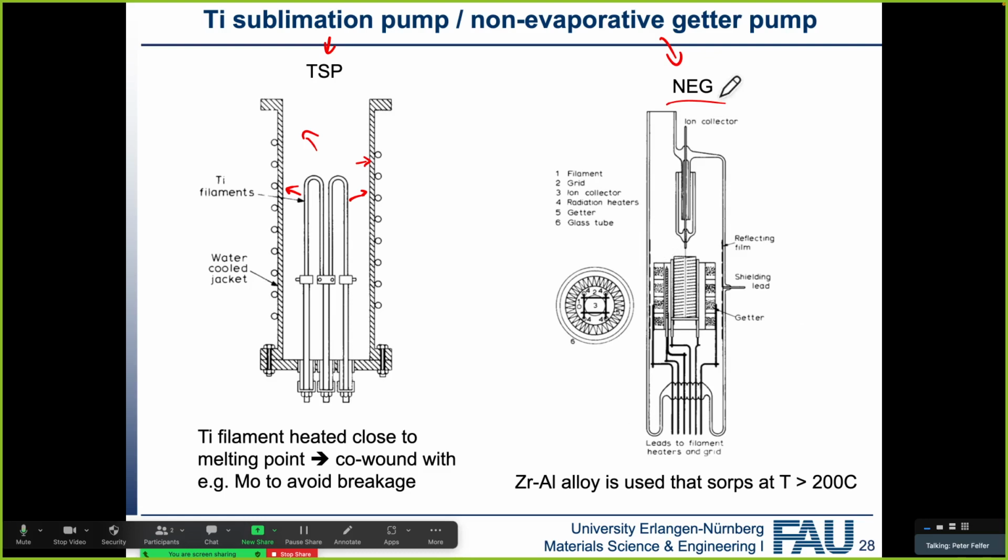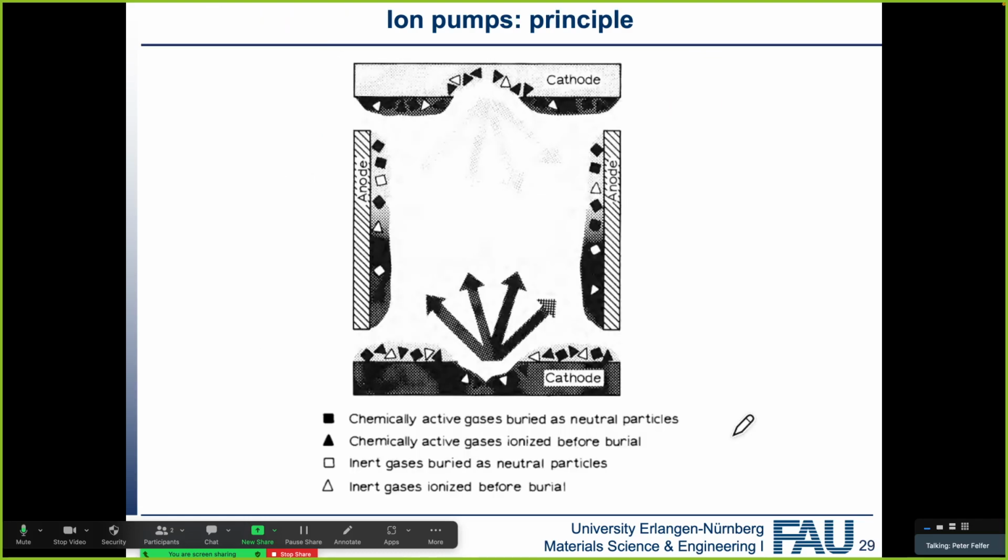and they're relatively expensive. But we have quite a few of them in operation in our atom probes and also in our titanium thermal desorption system. So very good because they're very robust pumps. Unless you give them too much contamination, then they become a bit of a problem.